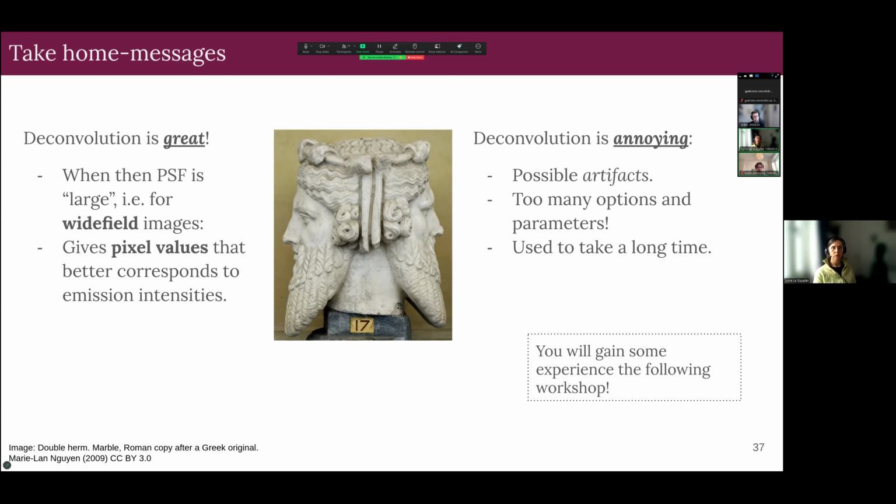So are they more or less based on Richardson-Lucy and then some tweaking? Most are, but they don't have to be. Okay. Do you have some sort of recommendation on how to choose one versus another? I would start with Richardson-Lucy or some accelerated version.